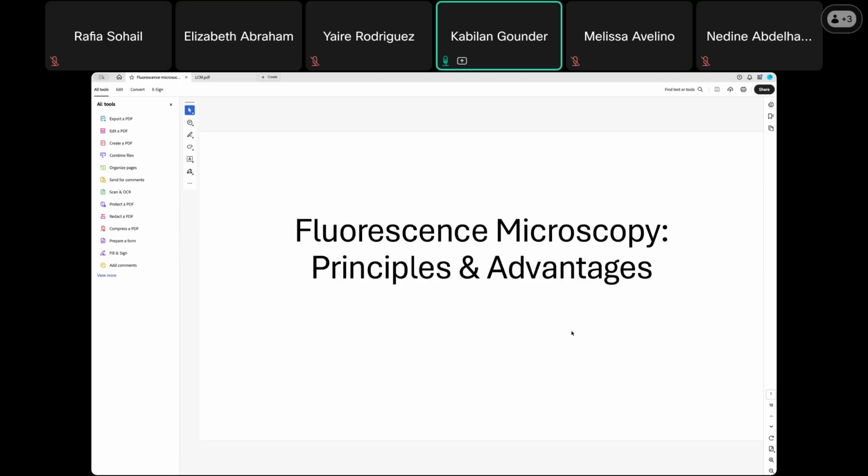Thanks. So today we are going to discuss again the fluorescence microscopy principles and advantages. So what is the advantage of fluorescence microscopy? We discussed it before, light microscopy and also fluorescence microscopy. Fluorescence microscopy helps us to understand further not only the structure but also the cellular targets, what is going on with them and how they are affected.